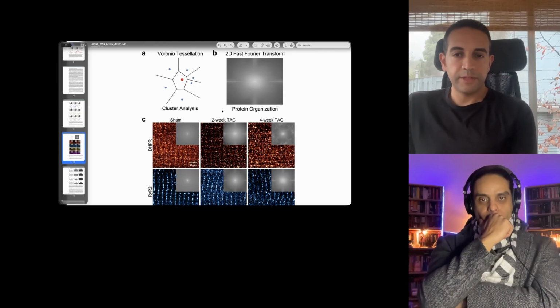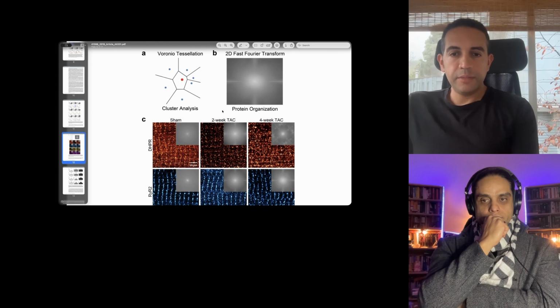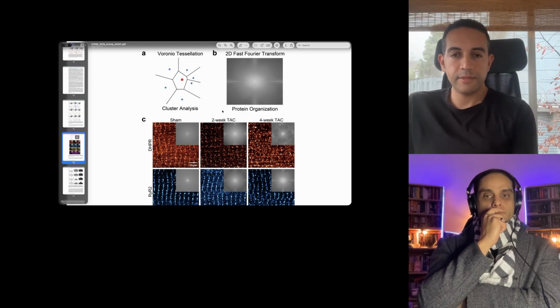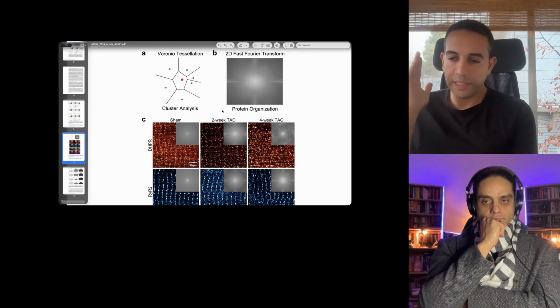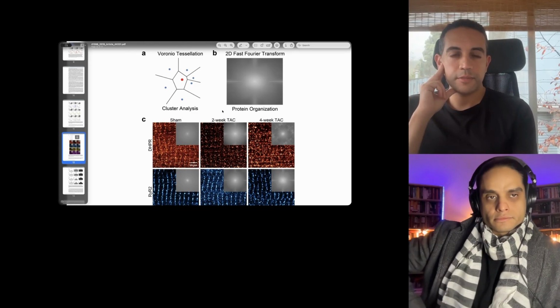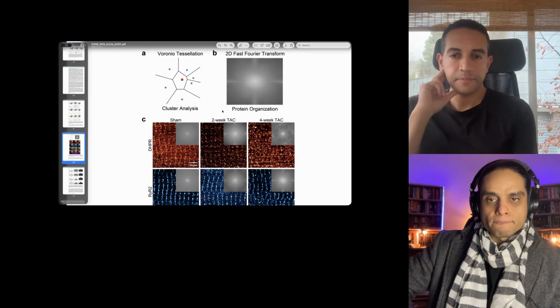There's a world where we could have done 3-color or 4-color imaging, but each fluorophore is going to give you different photophysical characteristics and slightly different resolution, so you'd be biasing your study. You want to keep that fluorophore exactly the same, so the results are comparable between conditions.